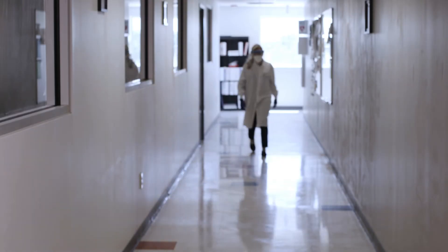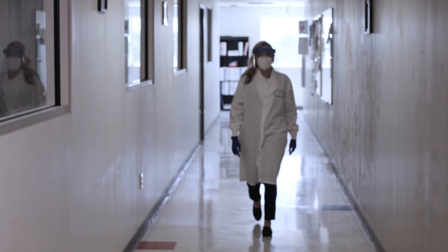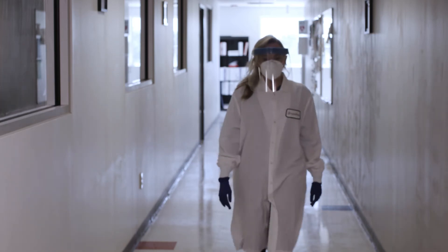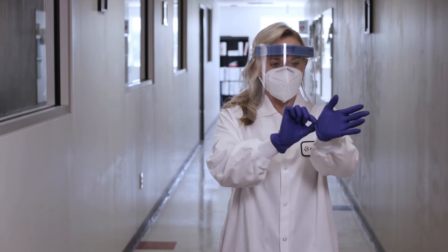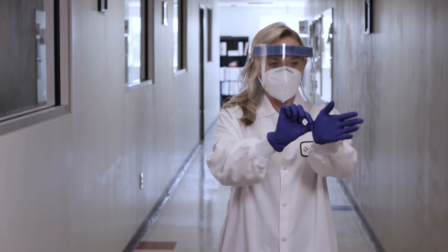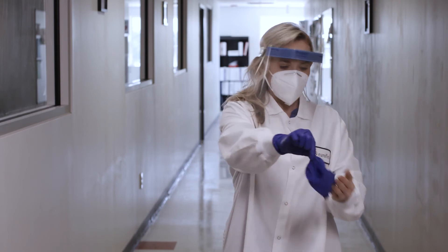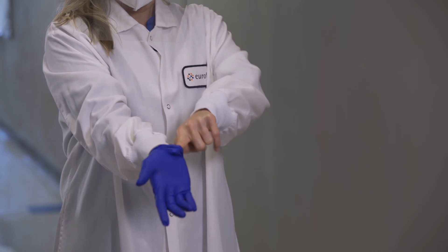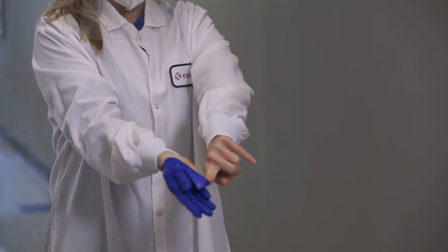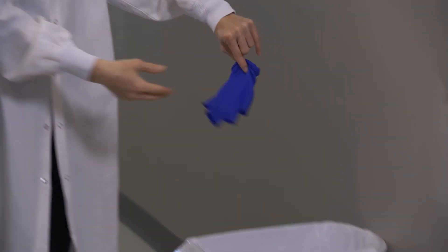When you have finished your sample collection and are ready to take off your PPE, use the following process to ensure you do not come into contact with the outside of your used PPE. Begin by removing your gloves. Start by pinching one glove at the wrist and pulling so that it turns inside out as it is removed. Discard this removed glove and then, with your ungloved hand, insert your fingers into the opening at the wrist of the remaining glove, being careful not to touch the outside of the glove with your ungloved hand.